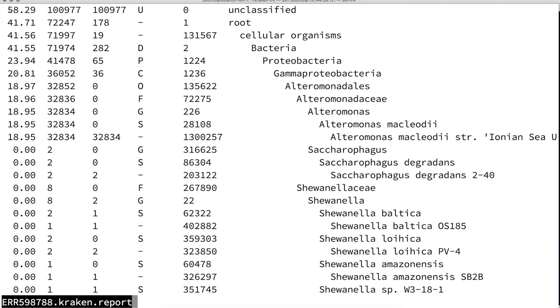This is getting more interesting. Here we have the percentage — 60% of the reads were not classified. There are several reasons for this: we are using a compact database with a limited number of species, and second, contaminants such as human reads will not be classified. The investigation of unclassified reads depends on the source. This column represents the taxonomic rank: domain, phylum, class, order, genus, and species.